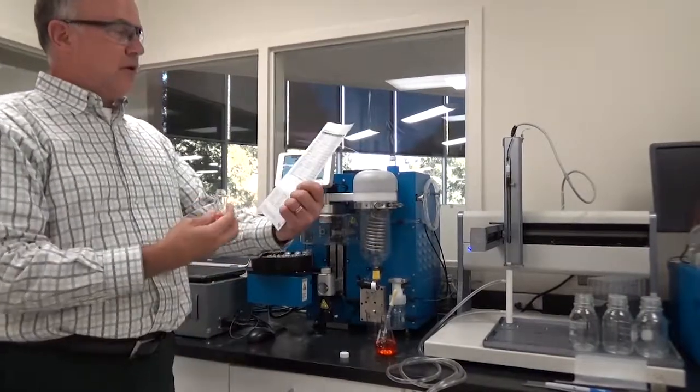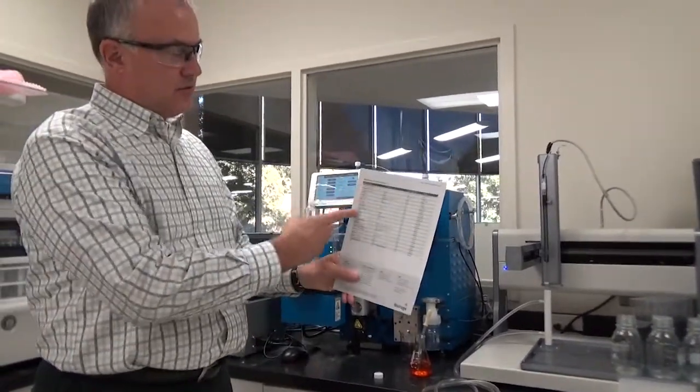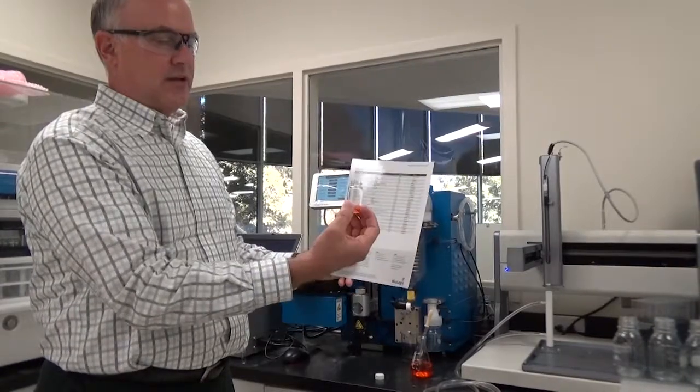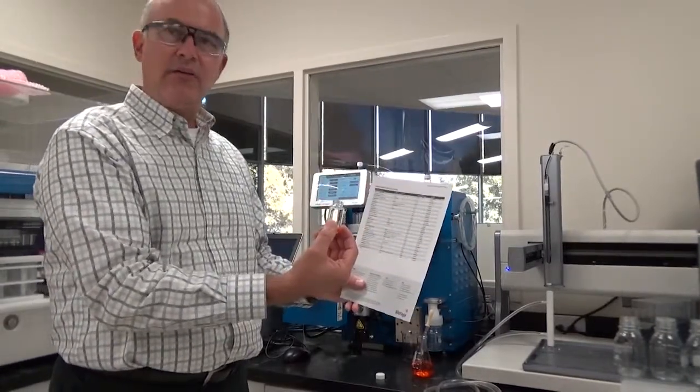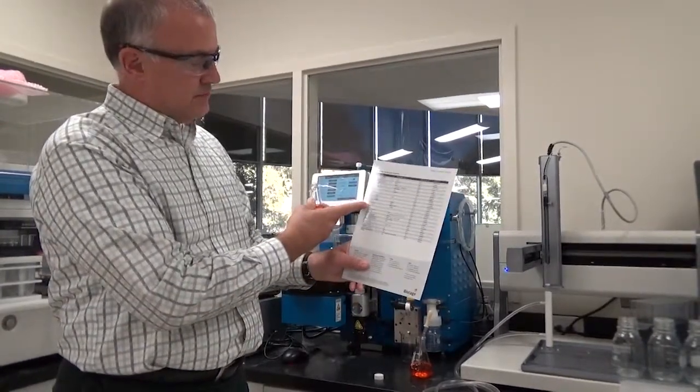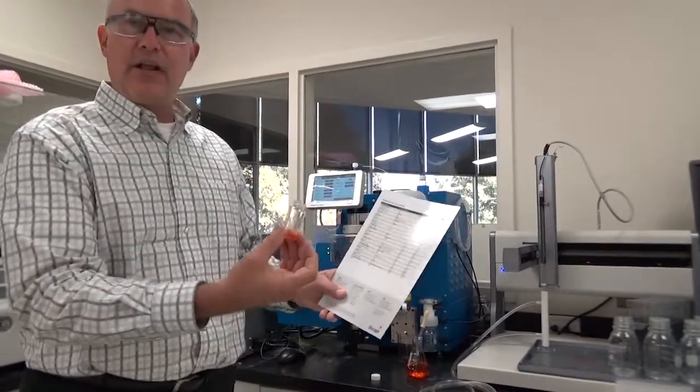And then you look on the back, and the same card tells you which program to use. In this particular case, I have methanol. So I look up methanol, and I use the volatile method.